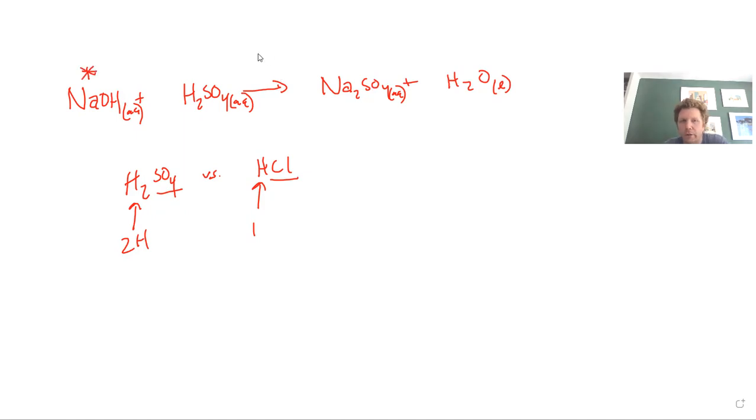What you need to know about this is, you're going to be given the concentration of sodium hydroxide. You're not going to know the concentration of sulfuric acid.